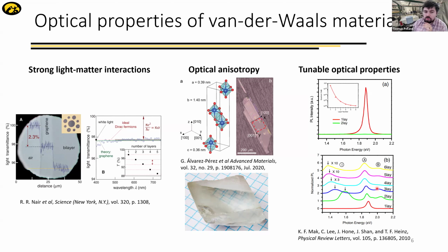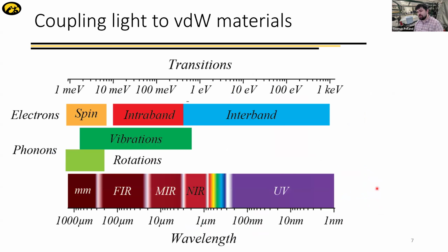So what's the challenge, or why is this not necessarily the most trivial? Well, first of all, especially if you're dealing with exfoliated materials, a flake of van der Waals materials, or even sometimes bulk crystals, like a single domain of a bulk crystallite, might only be on the length scale of, say, 100 nanometers to 100 microns.